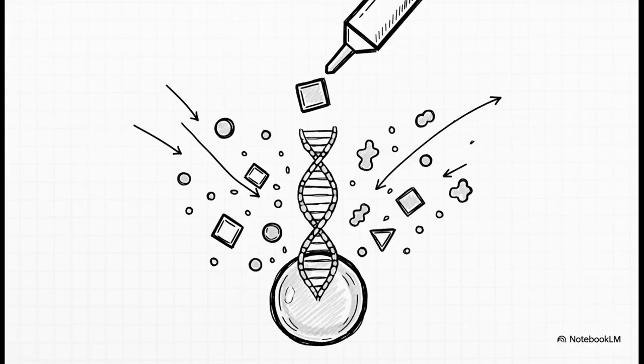The other game changer was a technique called solid phase synthesis. Basically, you attach the very first DNA letter to a tiny glass bead. The growing DNA chain is anchored, held perfectly still, while all the different chemicals just wash over it in sequence. It's like clamping the paper into a typewriter so the keys can strike one by one, perfectly. This is what made the whole thing automatable.